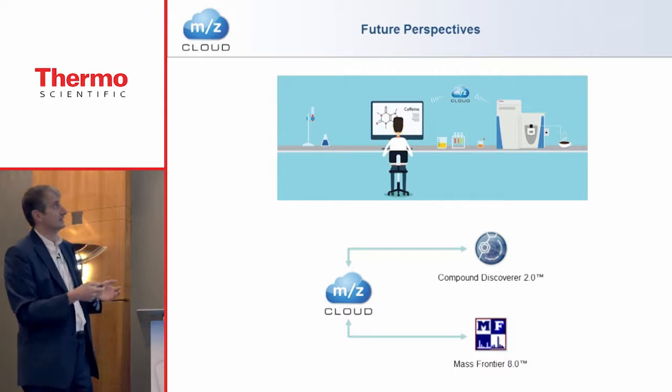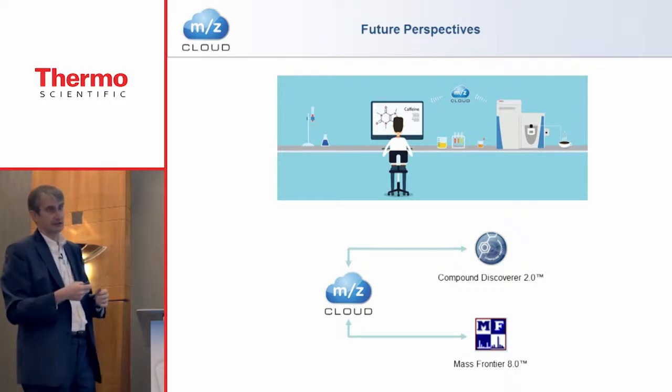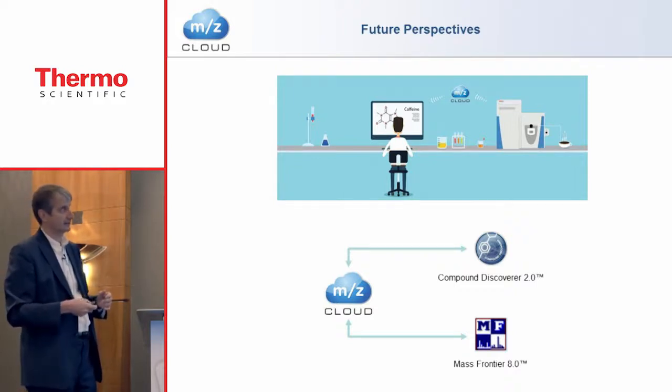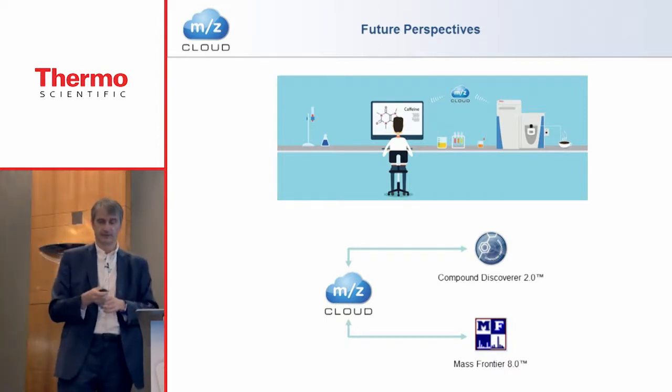Okay, in the future, you have heard today about Compound Discoverer, which is connected to mzCloud, and next year we will also release Mass Frontier 8 that will also work together with the mzCloud.